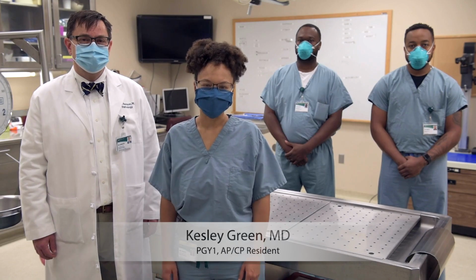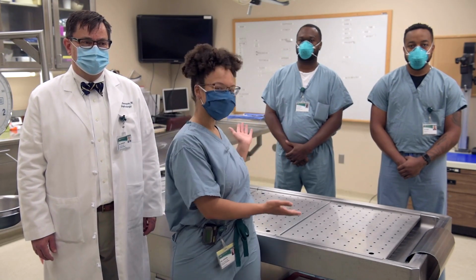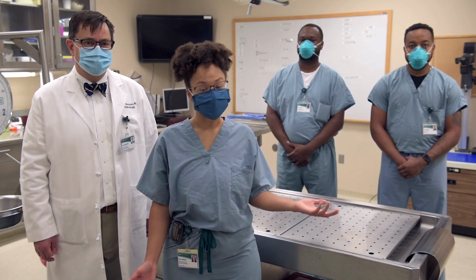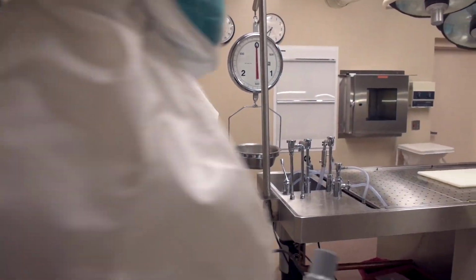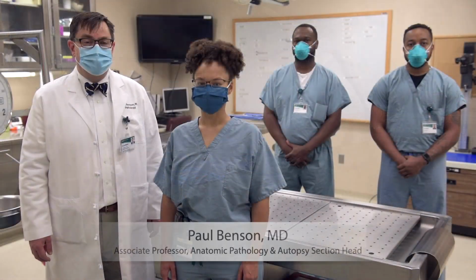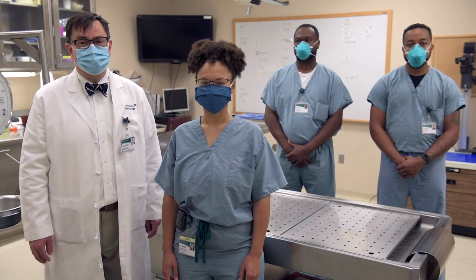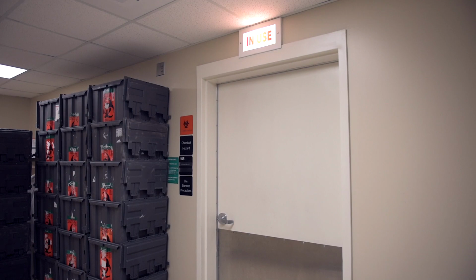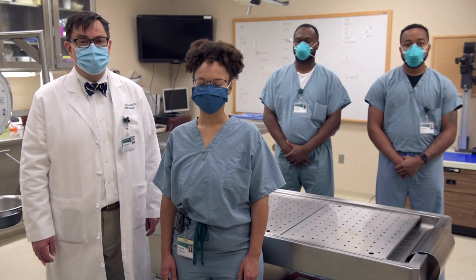Hello and welcome to UAB's Autopsy Suite. We have amazing attendings and the best support staff. This is one of our rooms and we have a mirroring room just like this. We also have a room for infectious diseases such as COVID, which is prevalent for these times. On the UAB autopsy service, we perform anywhere between 300 and 350 autopsy cases per year. So we have cases that are forensic cases, we have adult cases, and we also have perinatal autopsy cases here at UAB.